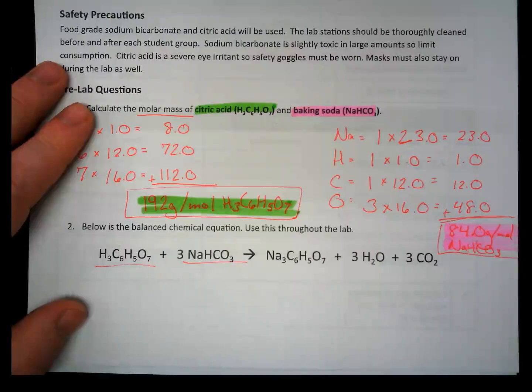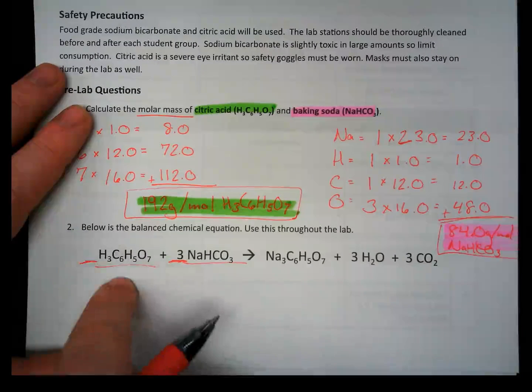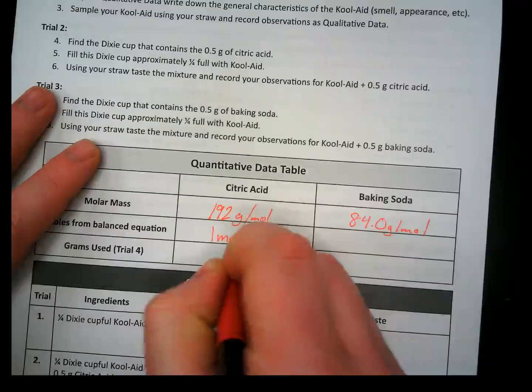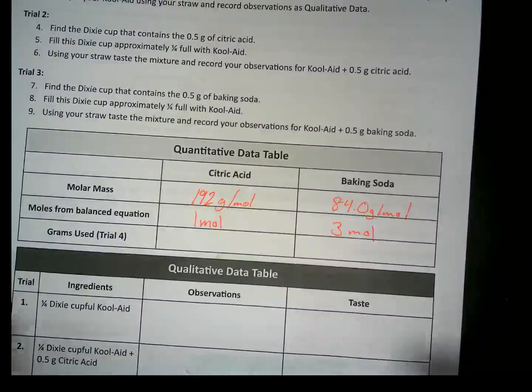Here is going to be our baking soda. And it looks like we've got 1 mole of citric acid to every 3 moles of baking soda. So there's 1 mole of citric acid to 3 moles of baking soda. Okay. Again, we're going to wait for trial 4 here.